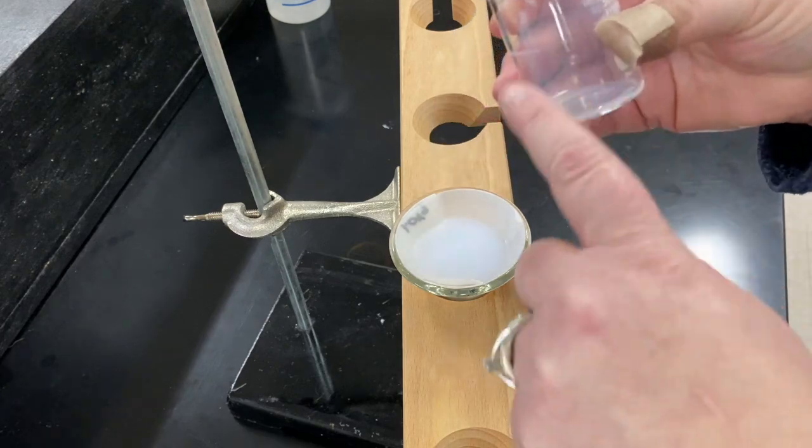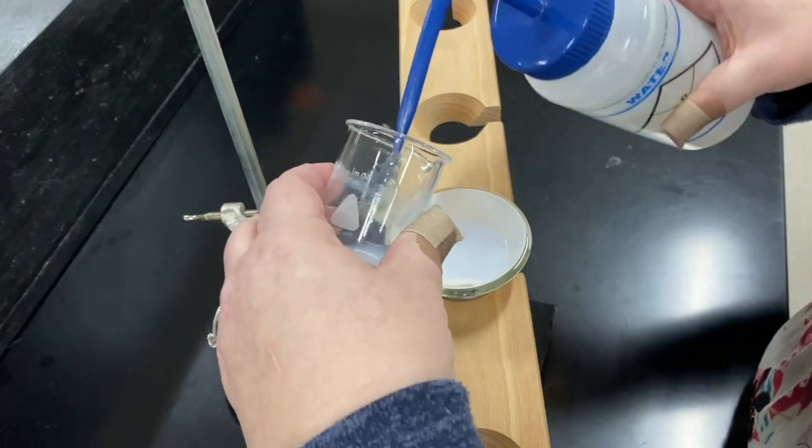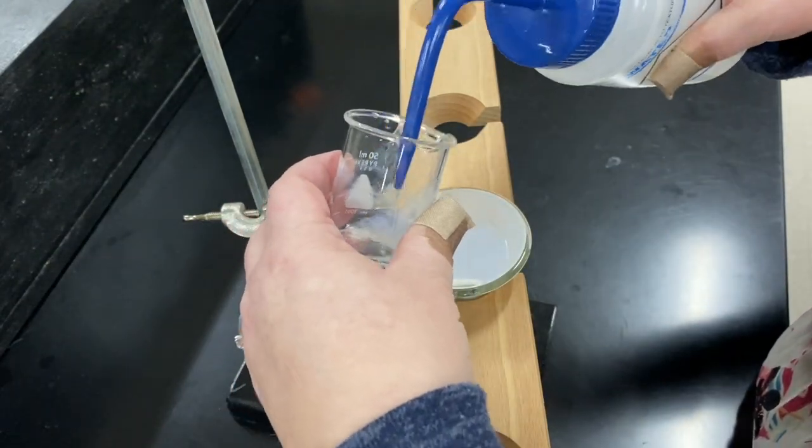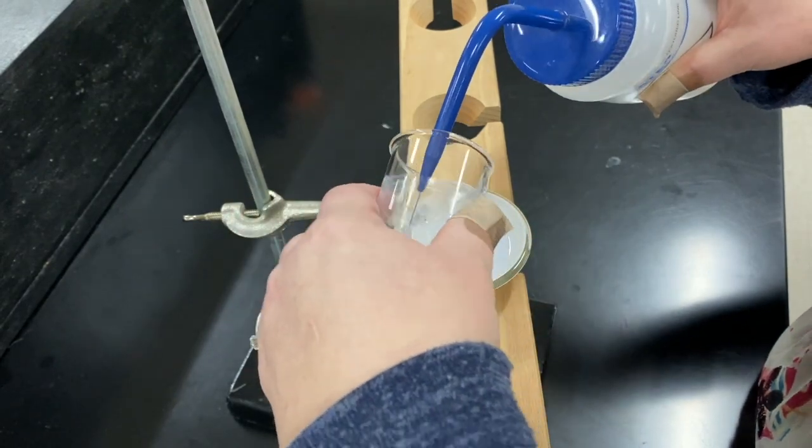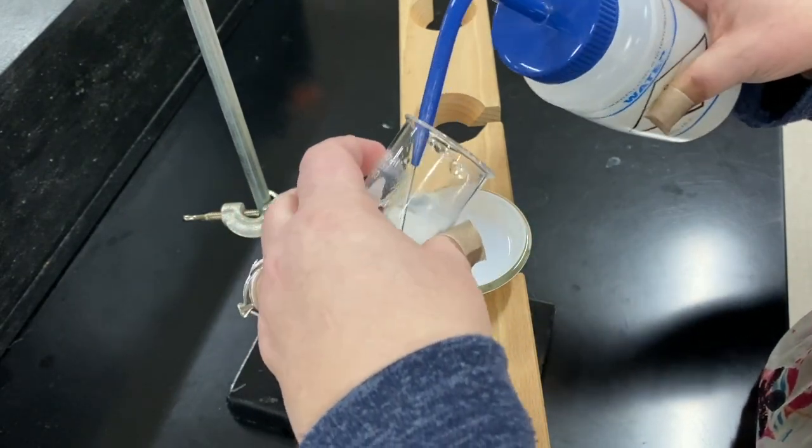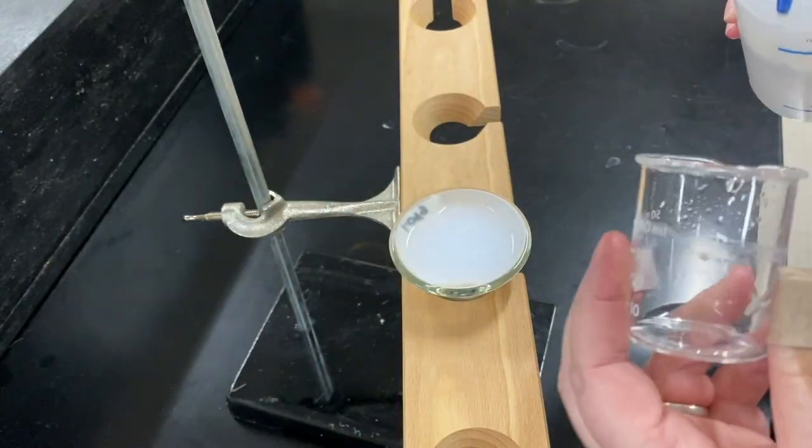You can see there's still some left into this beaker. I haven't caught everything yet, so I'm going to use a little bit of distilled water to rinse that out, but we want to catch everything. Again, not going over the top of the filter paper.